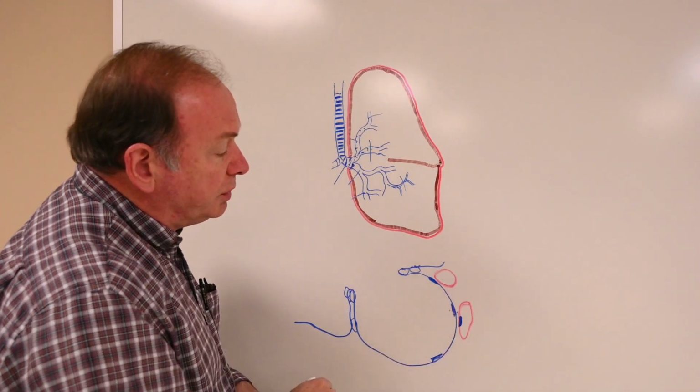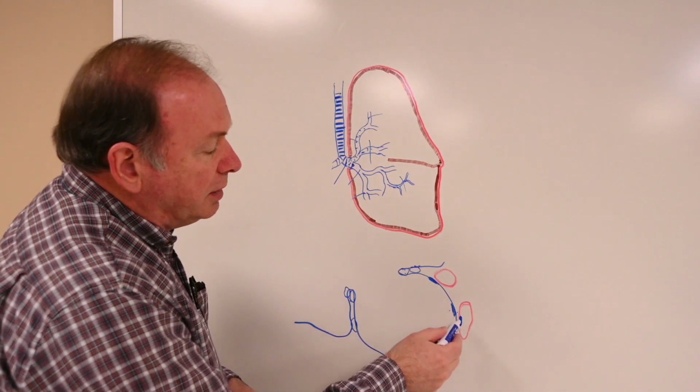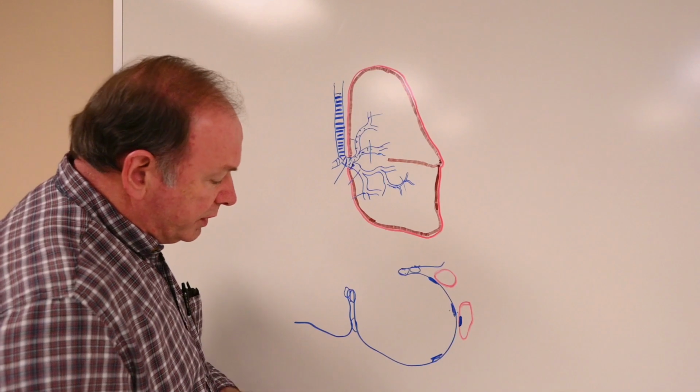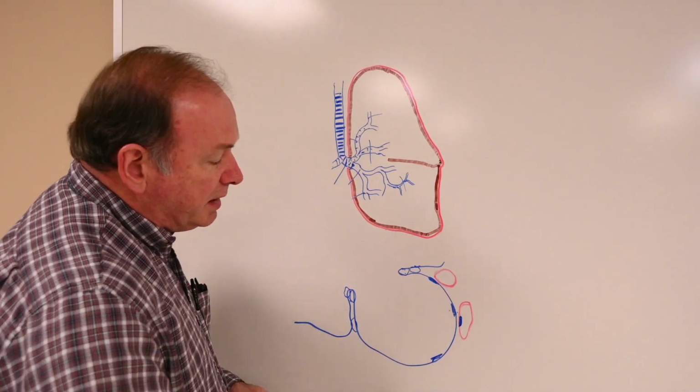and indistinguishable in some locations. So we'll look for type 1, type 2 alveolar cells, we'll look for endothelial nuclei, and then finally we'll be looking for dust cells. Dust cells occupy the spaces in here.